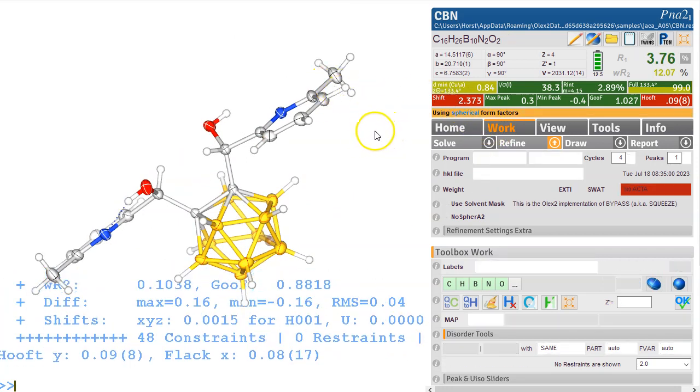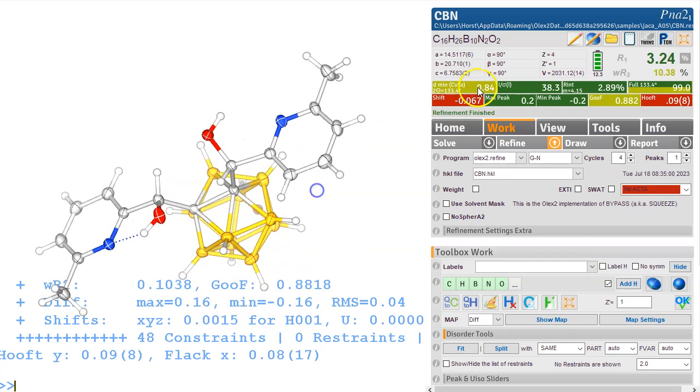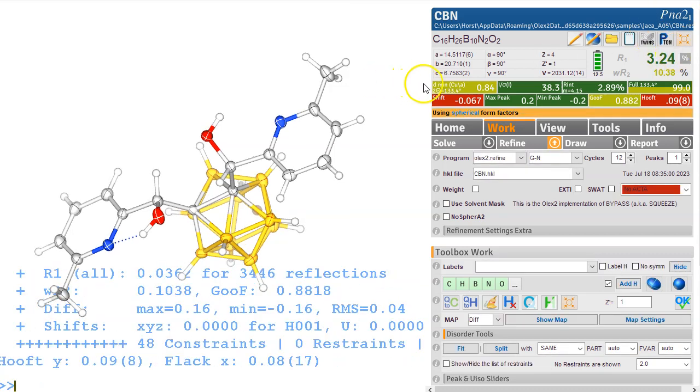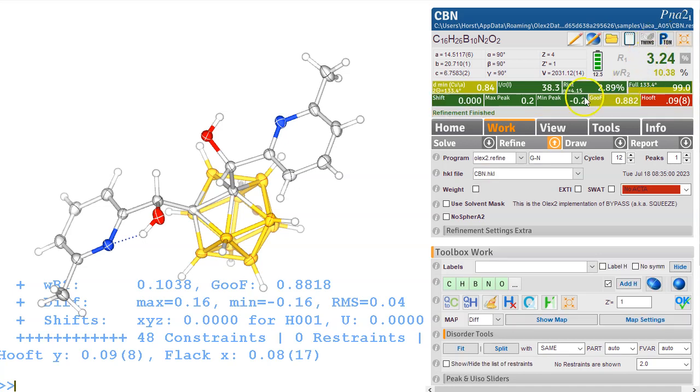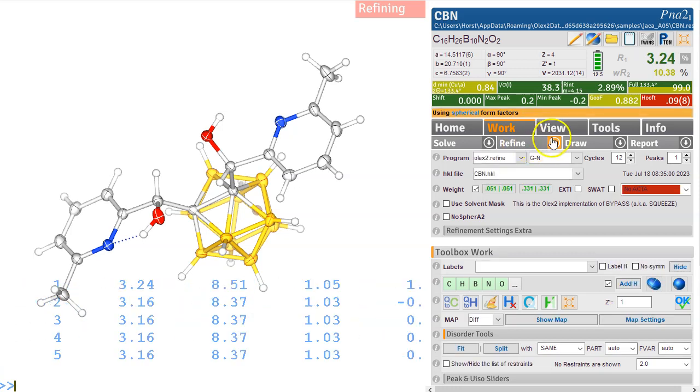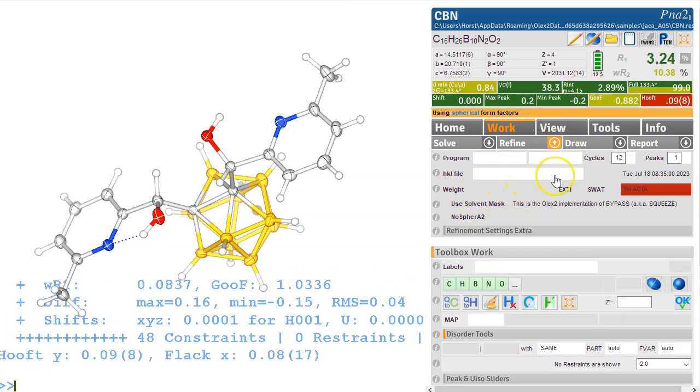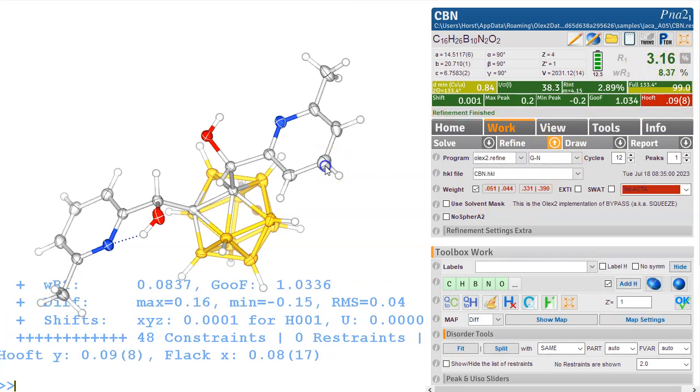So let's have a look at it. So it's not much movement. Let's do refine. Let's use 12 cycles. And then it should hopefully settle. What else have we got here, the weighting scheme needs to be switched on. We haven't done this. Goodness of fit is 0.88, is not bad. But of course, the weighting scheme we should always try to switch on and see. It always makes a bit of a difference, especially to WR2, of course.